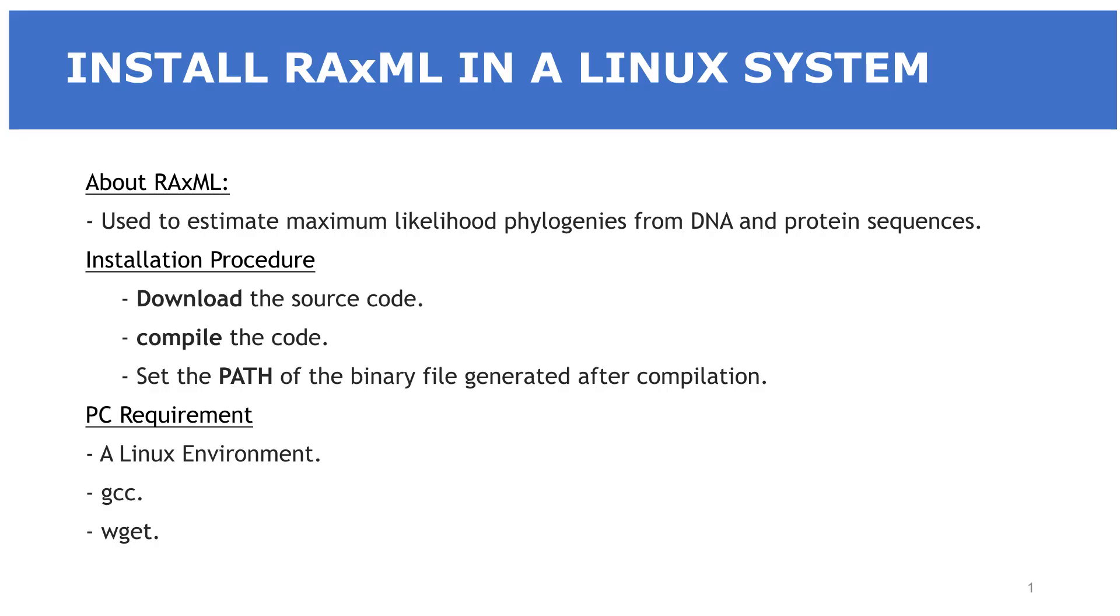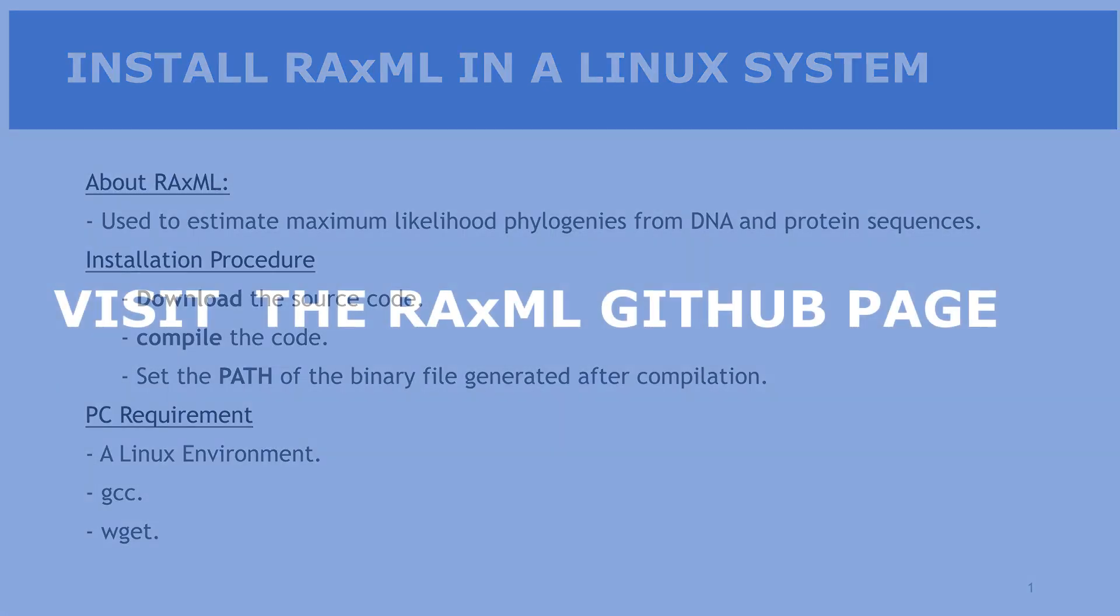In this tutorial, I am going to show you how you can install and run RaxML in a Linux environment. RaxML is a tool that is used to perform maximum likelihood phylogenetic analysis. You will download the source code, compile it, and then set a path to the binary files that will be generated after compilation. In order to follow this tutorial, you need to make sure you have Linux installed, and you also need to have GCC installed.